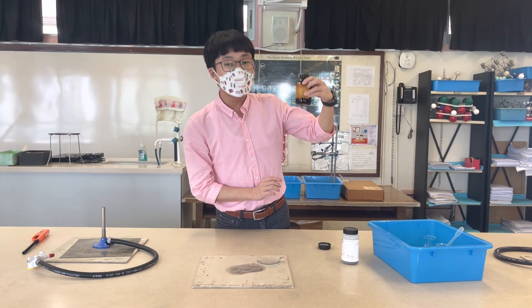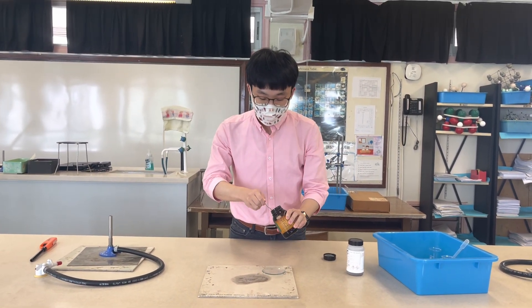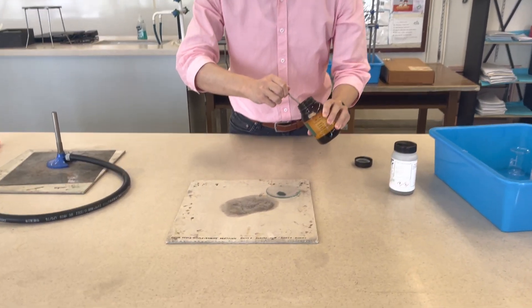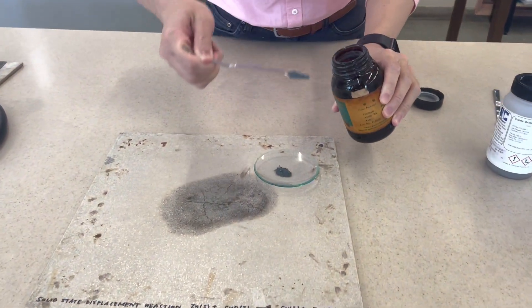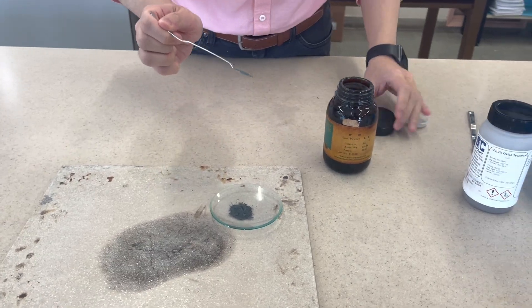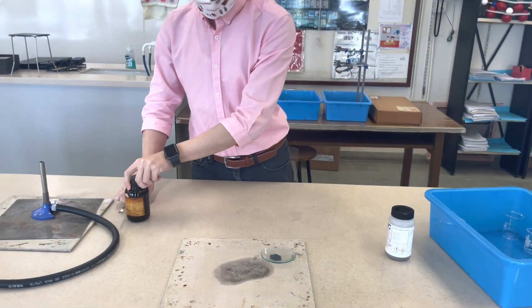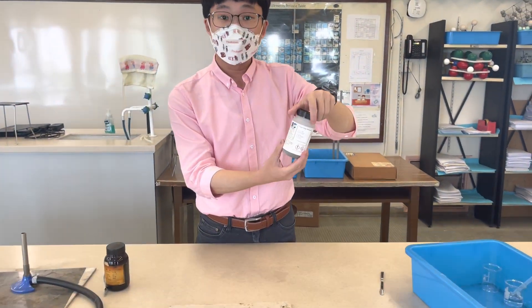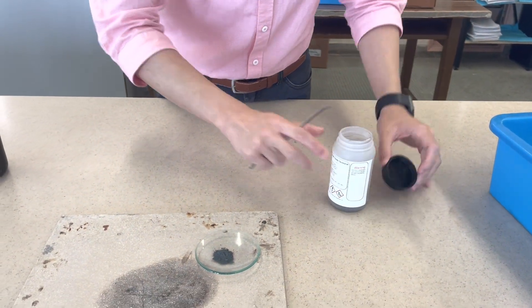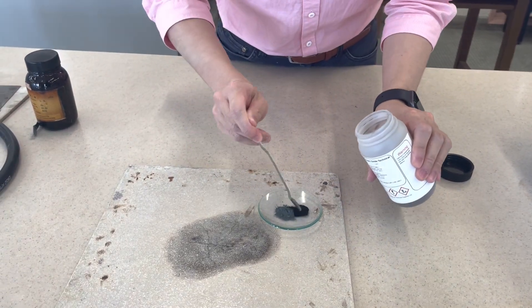This one is the zinc metal — zinc powder — and we are going to obtain about one or two spatulas of zinc powder. Observe the color: it is gray. And right now I also have copper(II) oxide here. Observe the color of copper(II) oxide — it is black.